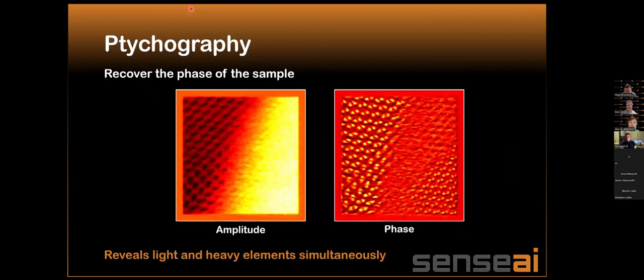Finally, we can also perform ptychography. In this case, it's the Wigner distribution deconvolution algorithm. What this is effectively doing is saying that we know that our sample got in the way of the beam, and given that posterior, how then would our sample look in that case? It's very similar to the charge density with slightly higher resolution, and we can extract effectively the phase of our sample, regardless of how heavy or light.